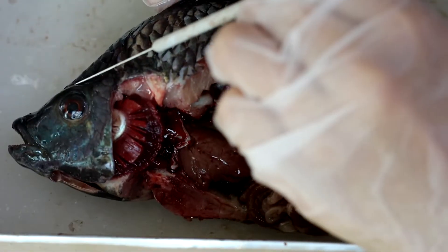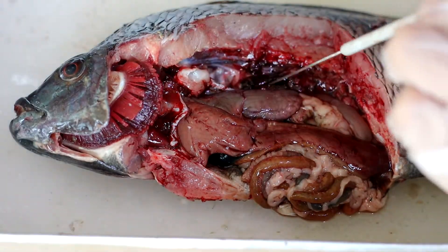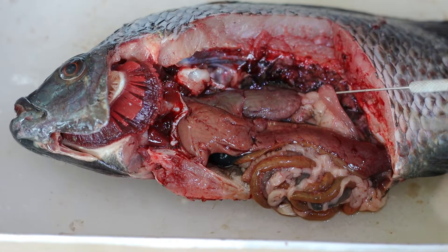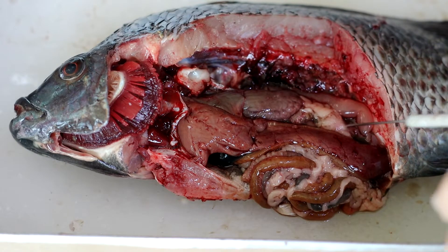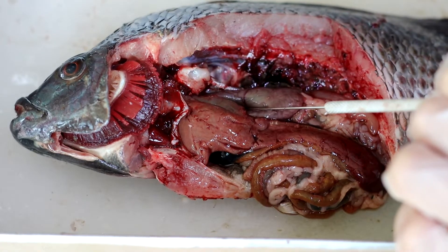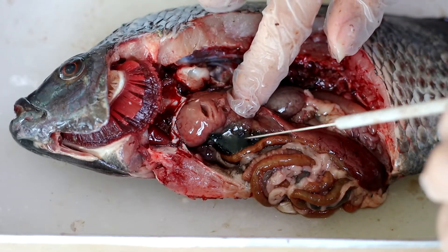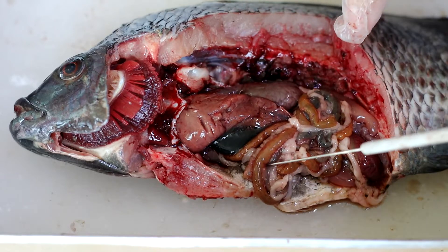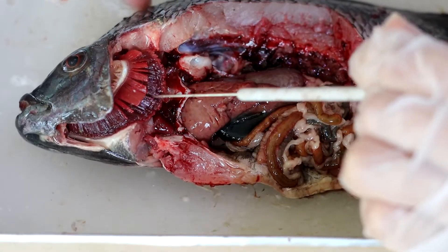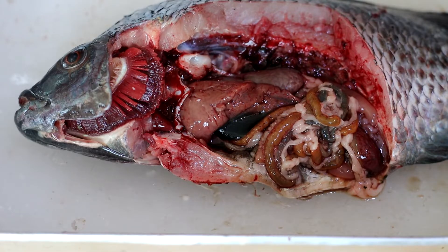Now let's move on to the internal organs of the tilapia. Here is the eye, and right here you can see the brain. Here is the kidney, the swim bladder, and the testis. This one is the stomach, this one is the liver. Right here is the spleen, and these are the intestines. Right here is the heart, and this one is the gills.